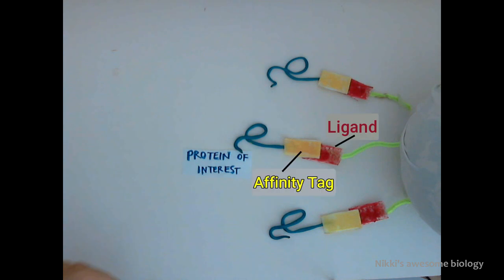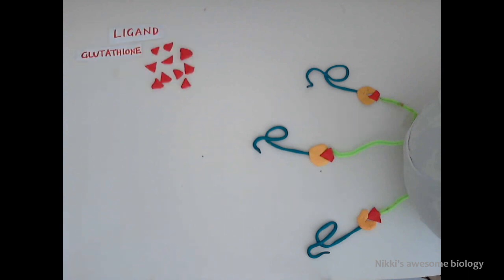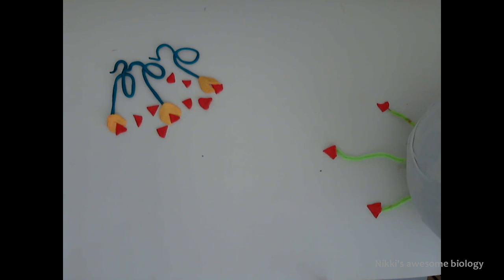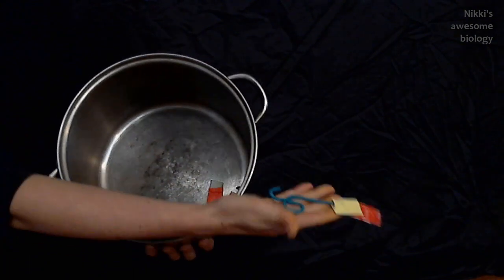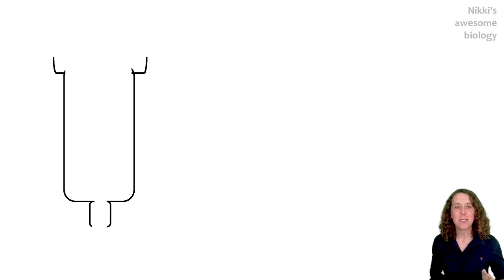A specific example: if you've used glutathione S-transferase as your affinity tag and glutathione as the ligand, you can add a bunch of glutathione in excess to your column. This will bind to your GST tag and elute all of the protein off. After adding free ligand, the elution will still contain your protein of interest and its affinity tag, but in this case it'll be bound to the ligand.